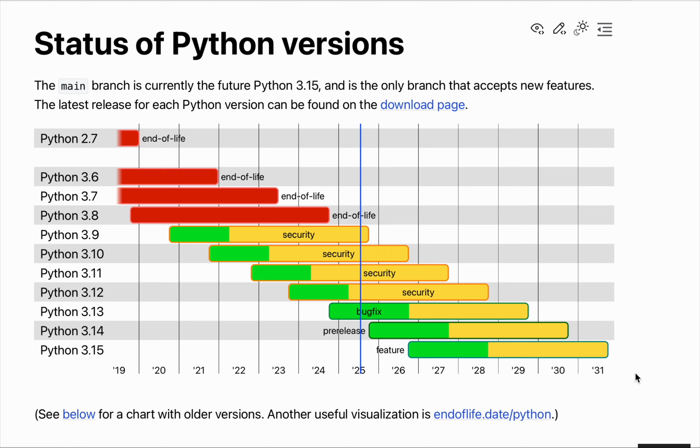Hello everyone. I would like to show you how to install McSAS3GUI on Mac OS X. The installation procedure and the way to execute McSAS3GUI is very similar on Windows, but I will make a separate short video about that.